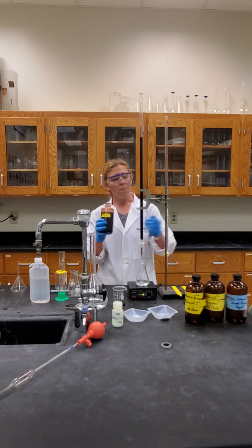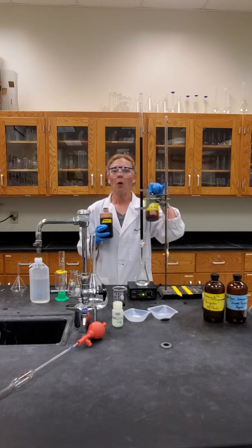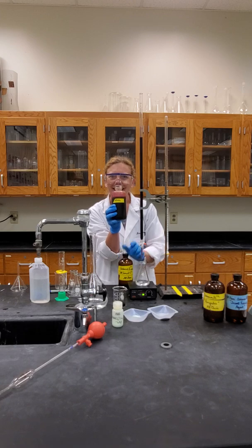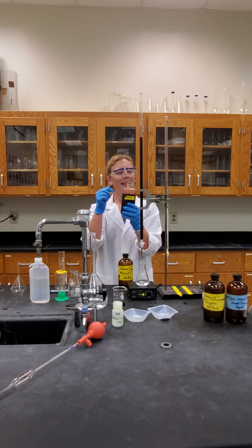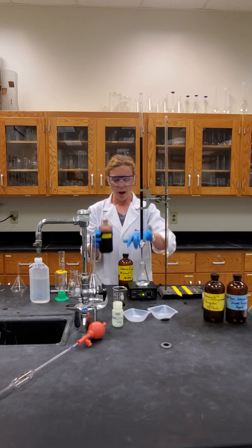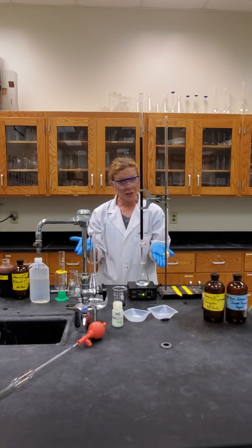Then in part two, you're going to obtain 25 milliliter samples of your unknown — three trials. It's already acidified, so you will start with that. You now know the concentration of the permanganate. If we know the volume and the concentration, that allows us to calculate the moles. You have the balanced ion ratio of your reaction, but now we're looking for the concentration of the iron 2+ in the unknown. That is our exercise.